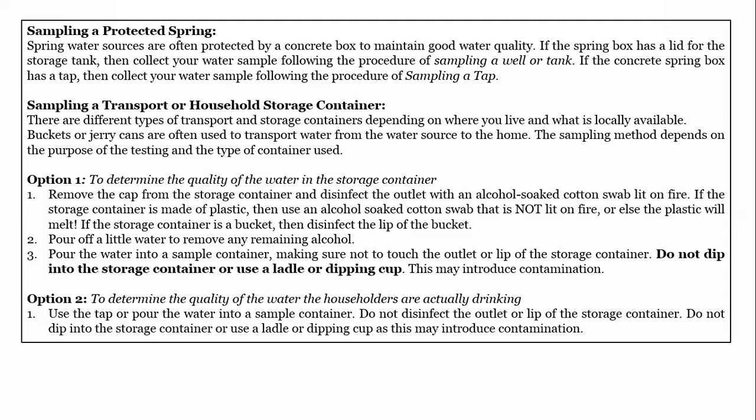And if you want to test whether the water your household consumes is actually contaminated from the source, then you are just going to do this particular practice by sterilizing the opening of the container. If you have something like a 20-liter gallon, you just need to sterilize the opening, and then you pour the water inside your sample container. This is pretty much the system.